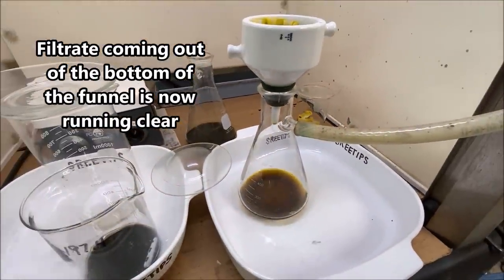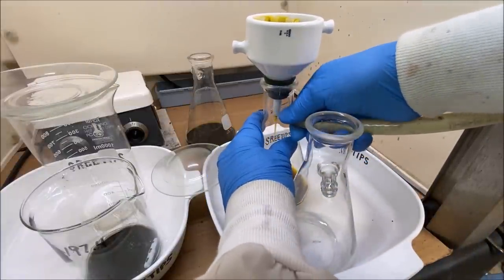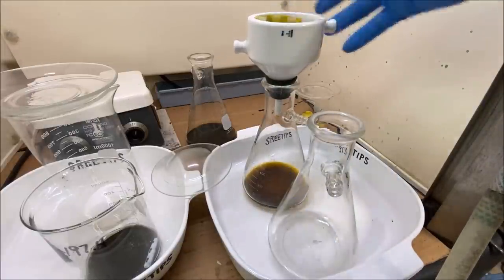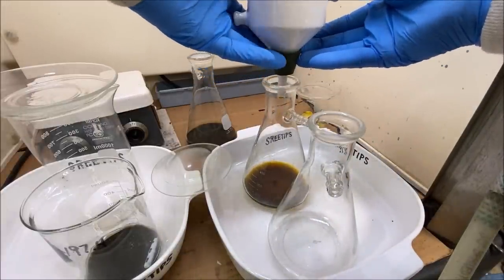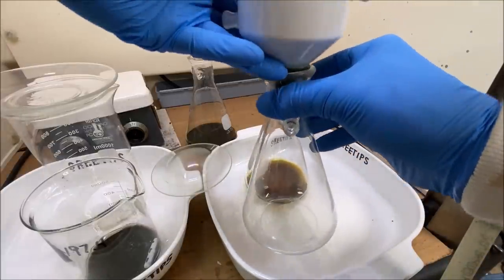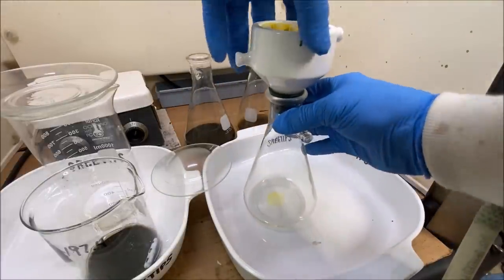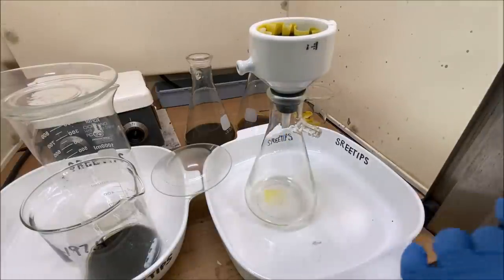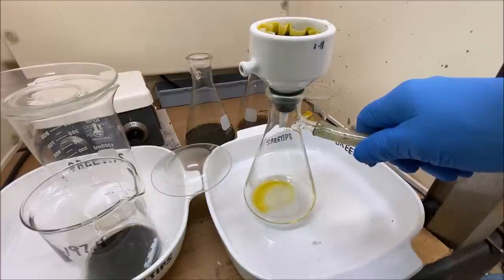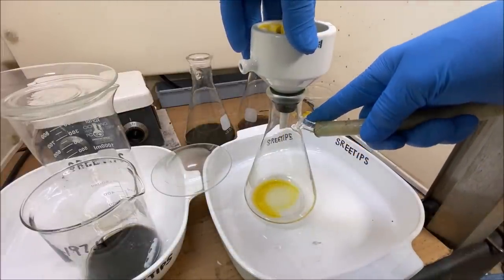Let's see. What I'm going to do here is take another filter flask. This out of the way. Transfer it over here to this clean flask. I'm about ready to call it here and admit defeat. I think I'm going to be able to pull this off. See how that starts to look there. That won't look too bad.